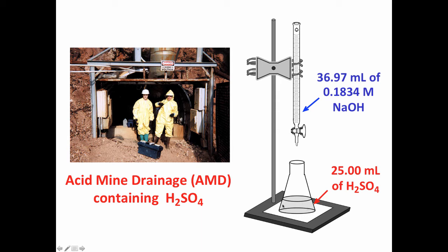When that happens, the solution goes from clear and colorless to a light pink. The goal is to get as light a permanent pink as possible. We would like to not over-titrate by very much. We always end up over-titrating a little bit. We'd like to be at by as little as possible. And by doing this, we can find, in this case, the concentration or the molarity of this solution.